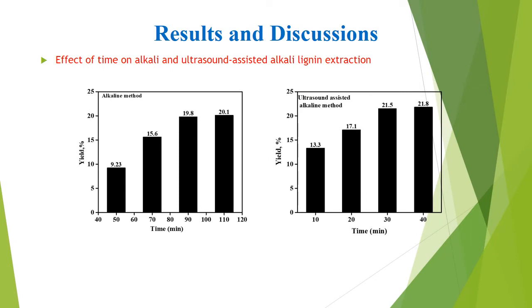Results and discussion. Effect of time. First, the effect of time on alkali and ultrasound-assisted alkali lignin extraction. The figure shows that the extension of treatment time tends to favor the lignin extraction yield. And this is the proof.